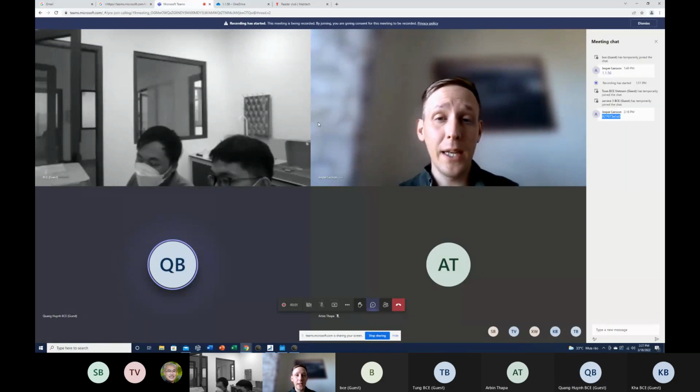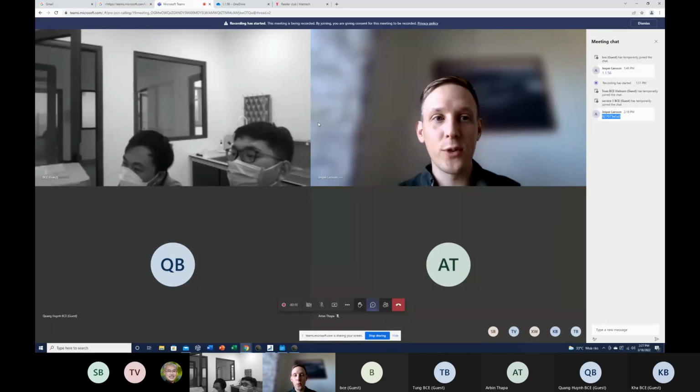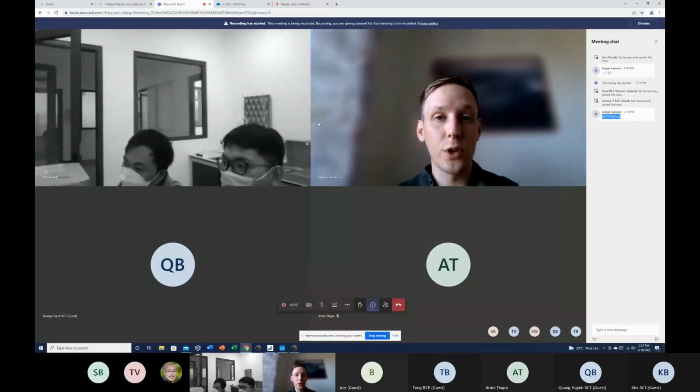Exactly. In the beginning now, since you're not really used to the data that we get from the plate, and also maybe not the images and analyzing that, I will give you a presentation now about things that I think you should look out for.